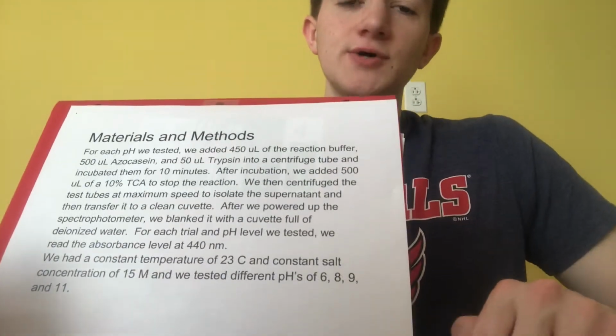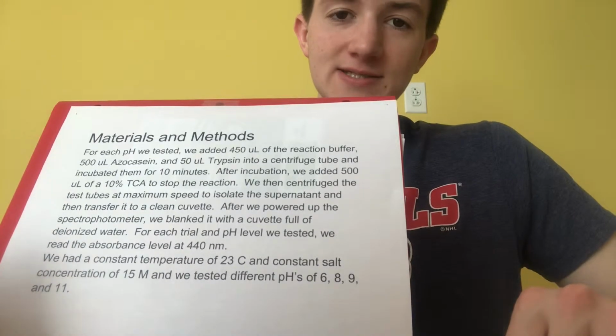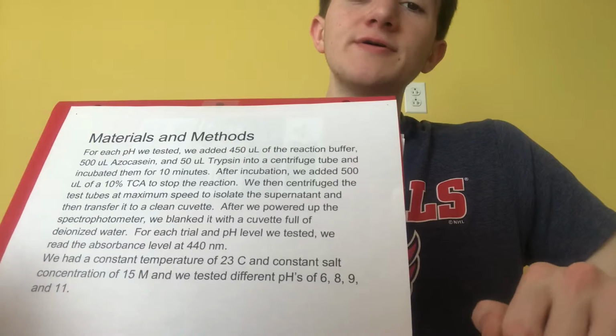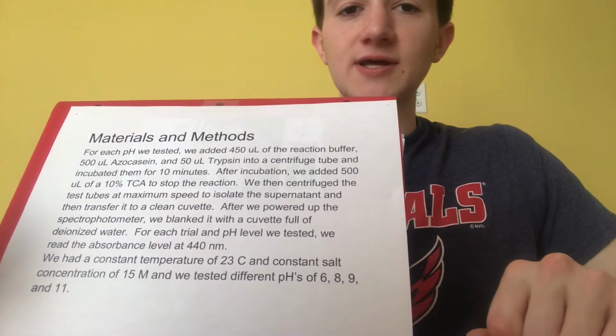We had 3 trials for the negative control and 3 trials for each of the pHs tested, so that way we could improve variance, increase accuracy, and eliminate any error that happened during the experiment.